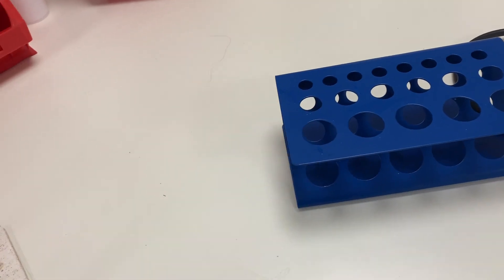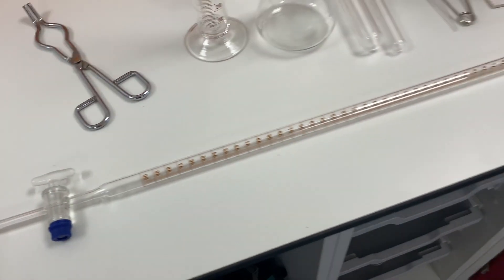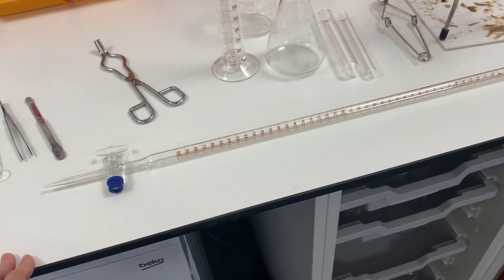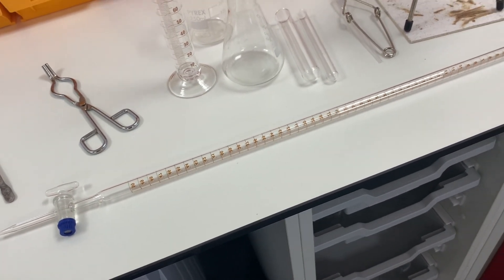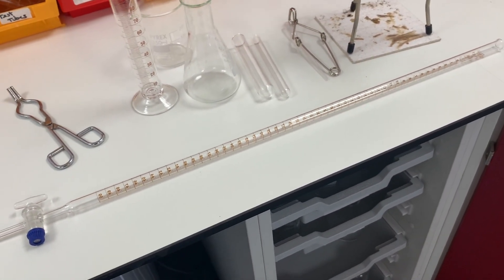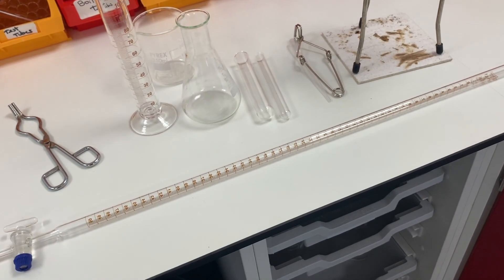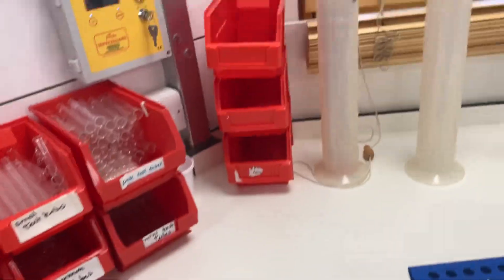Now I'm not going to pick this up, but this is a burette. This is used to measure volumes of liquid extremely accurately, and you may have seen them used in titrations. It's normally found vertically because you need to be able to read that volume accurately.